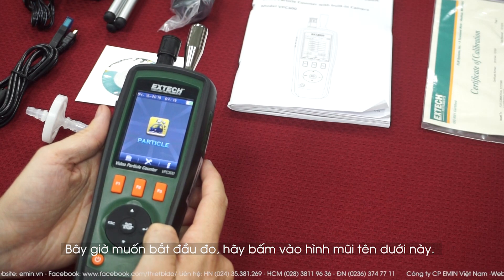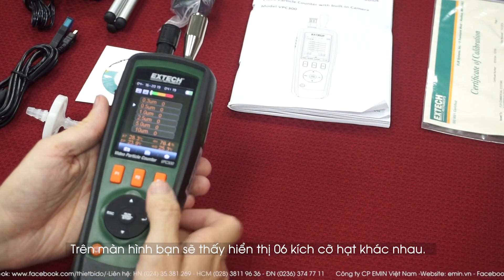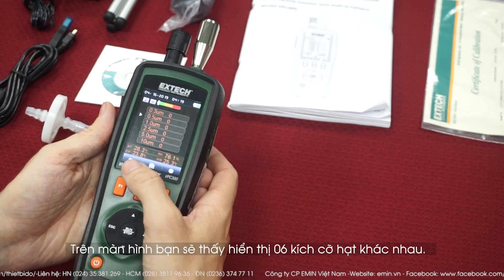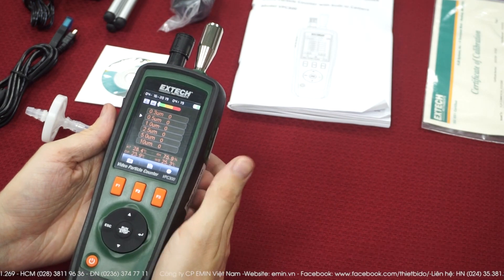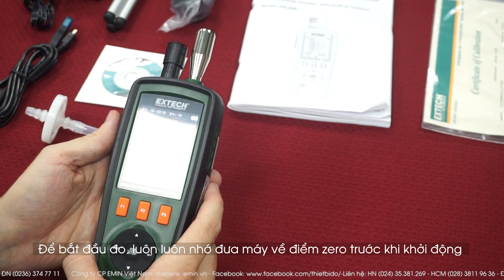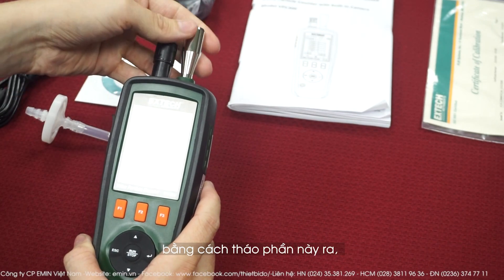Now if you want to make a measurement, you press the arrow down. In the middle of the screen you have the six different sizes of particles, the air temperature, the air humidity, the wet bulb, and the dew point. Before any measurements, you must set the device to the zero point, so for that you're going to unscrew the filter.